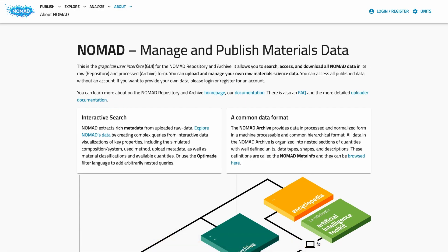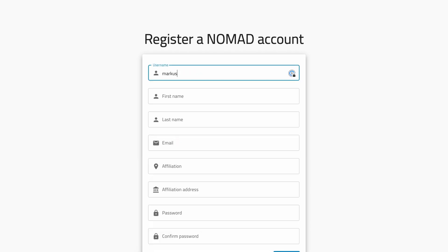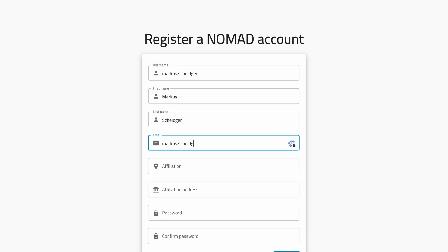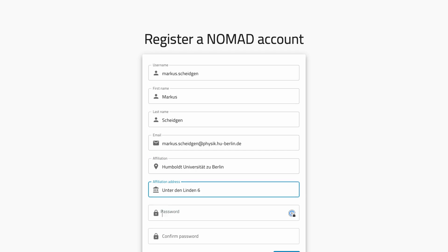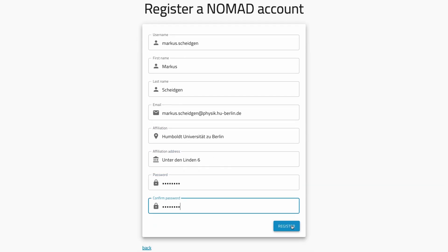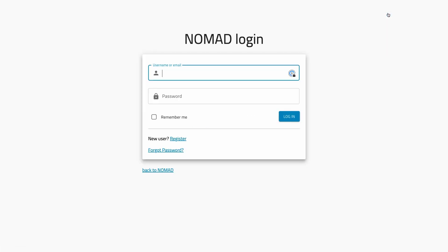While you can browse NOMAD and search and download data without an account, you need an account and login if you want to upload data. All data you provide will be provided under the Creative Commons attribution license. It will stay your data and we need to attribute you as the author. Creating an account is easy — simply fill out the form and provide your name, email, and affiliation. Your account will be created automatically and you will get an email with the activation link. After this you can simply login and activate the publish functionality.